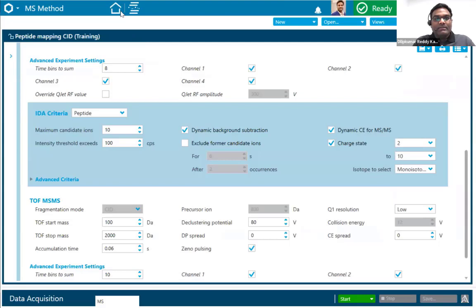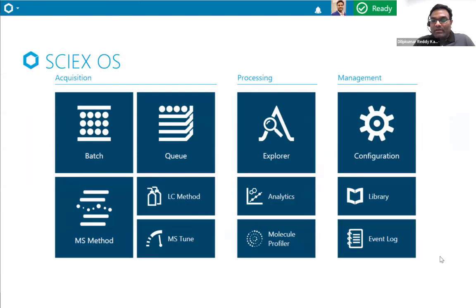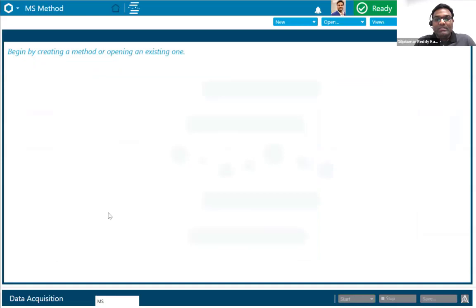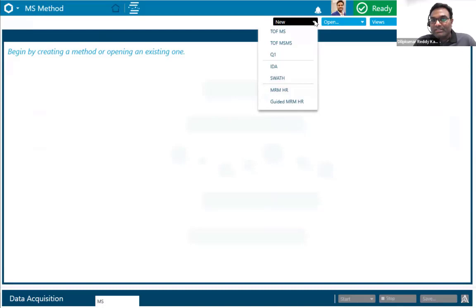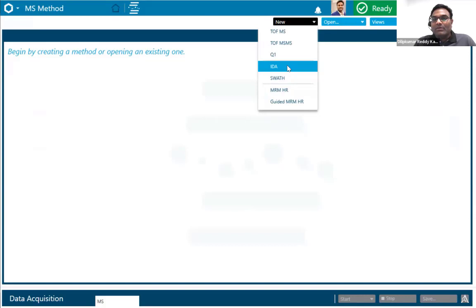This is the home screen of the SciEx OS software. It's very intuitive even for beginner or new users — they can easily navigate the software. For example, if you want to make a new method or open an existing method, you go to the MS method workspace. There is an option for different scan functions. Generally for intact mass we use TOFMS, and for peptide mapping workflows we use IDA — information dependent acquisition, also known as data dependent acquisition. I have already saved a method for both intact and peptide mapping workflows.